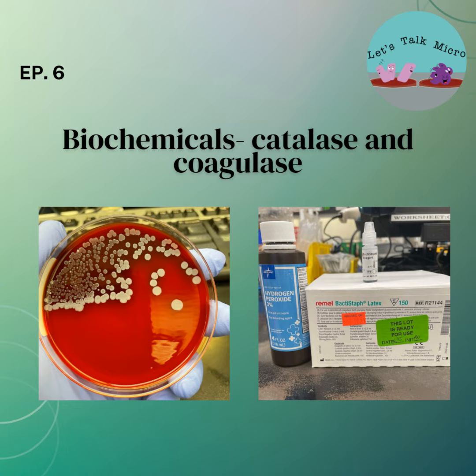That's one of their trademarks. Another example is catalase. Staphylococcus species are catalase positive. So sometimes, the biochemical reactions can be enough to identify certain organisms as long as some conditions are met. And this is what we call a presumptive ID, but I will talk about this in another episode.